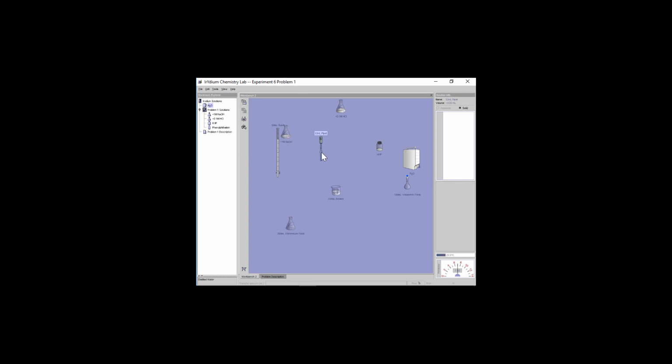Most of our pipettes are 10 mils. Basically, this acts as a straw. I'm going to put this pipette in the solution. Even though I've calculated the concentration of KHP here, I'm not going to be testing against the entire solution. I don't need all the base to kill all the acid. I'm just going to kill 10 mils of this acid. And just using stoichiometry, I'm going to figure out what's the relative proportion between the KHP and the NaOH.